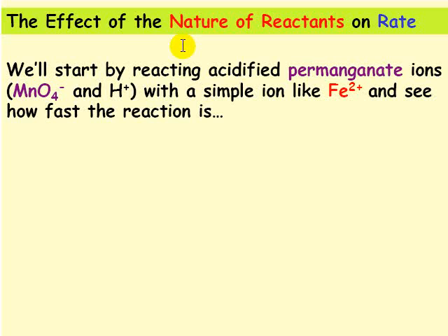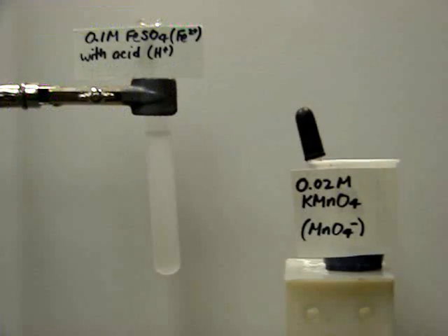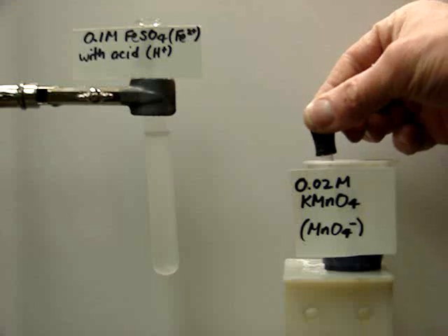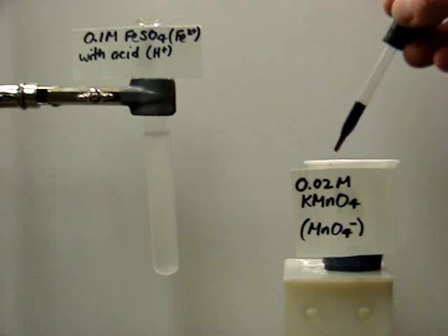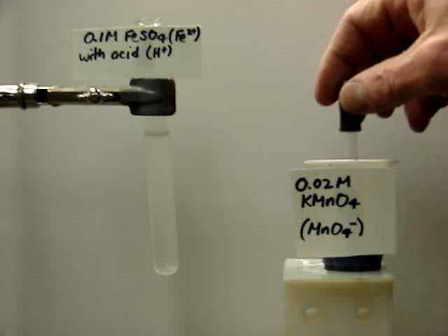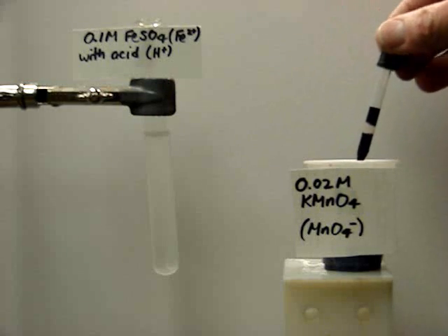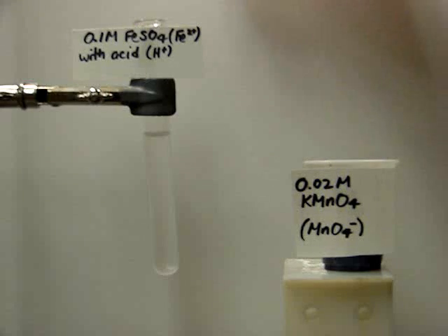Next we're going to look at the effect of the nature of the reactants on rate. We're going to start with some purple solution called acidified permanganate, which is MnO4- with H+. And we're going to react it with a fairly simple ion like Fe2+, and see how fast the reaction is. In this experiment, we're going to put some purple KMnO4 solution into a solution of FeSO4, which is the source of the Fe2+. This solution has been acidified.